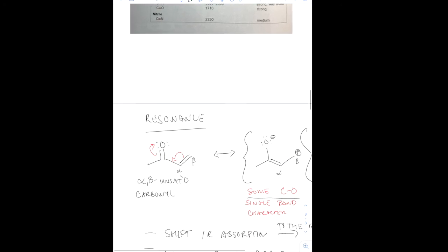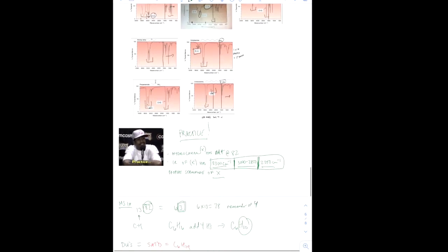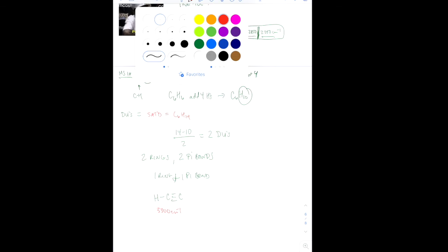And it is a hydrocarbon, so it's very possible that we can have an alkyne. So we'll have a C-sp-H. So let's go back down now. That means if we have a C-sp-H, we have to have at least that portion of the molecule in it, and this would contribute to the 3300 inverse centimeters. Let's look at the 3000 to 2850 now. This is pretty straightforward.